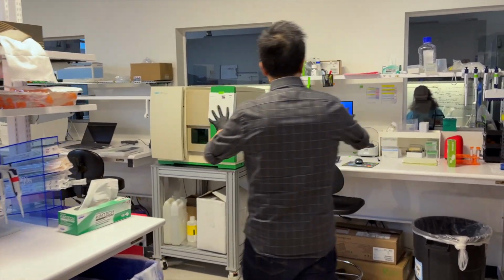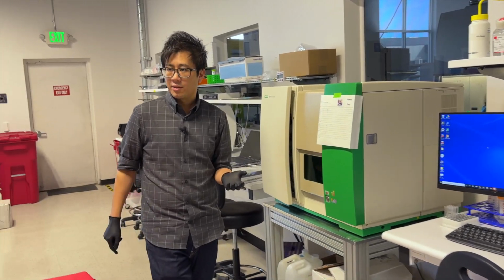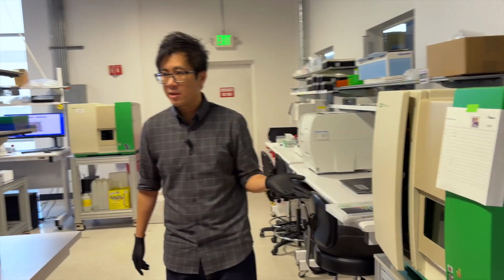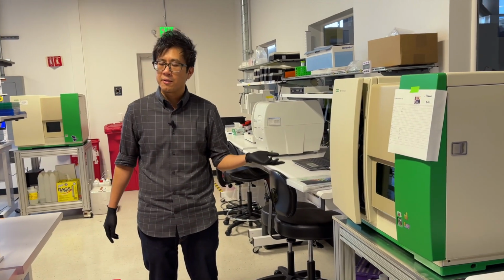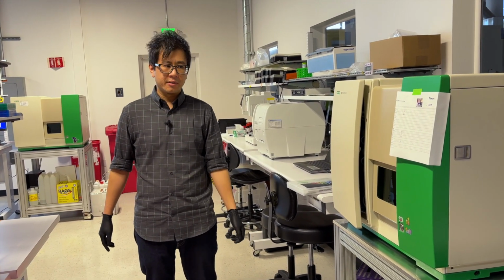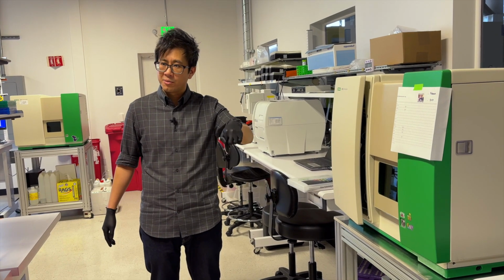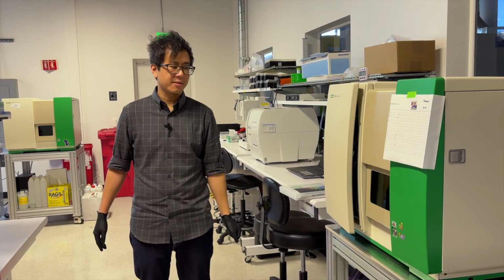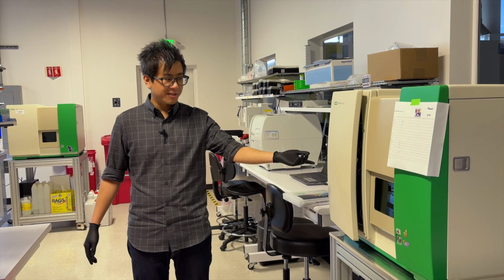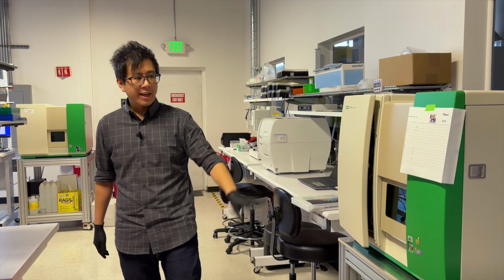Other general bench space here. So as I've mentioned, we do a lot of high throughput flow cytometry. And so this is one of the flow cytometers that we use. Works with 384 well plates. Most of our screens are at a 384 well scale. And for those familiar with flow cytometry, it works very similar to a flow cytometer. There's a probe that will aspirate cells and then look at surface expression of targets after you stain them. This is a probe on a gantry that will do that for every well in a 384 well plate.